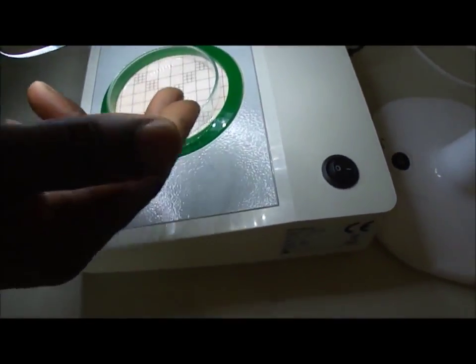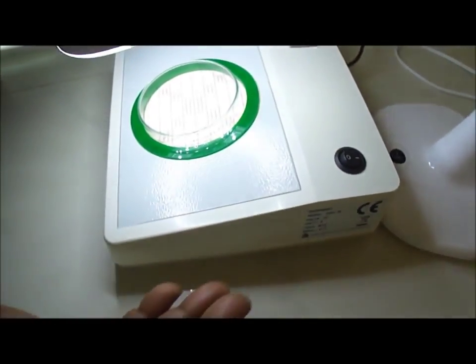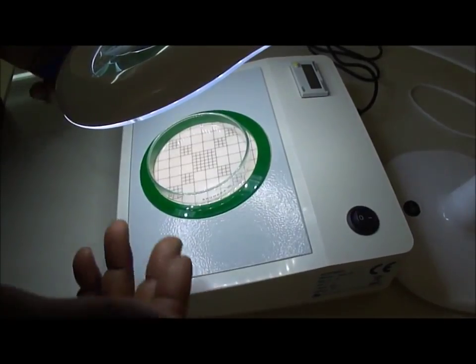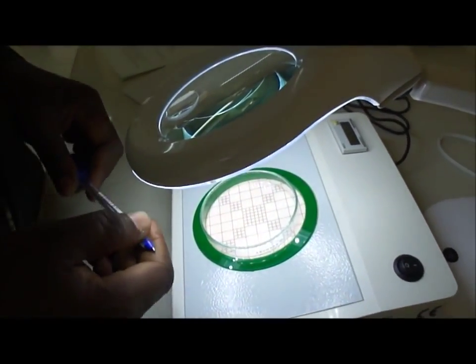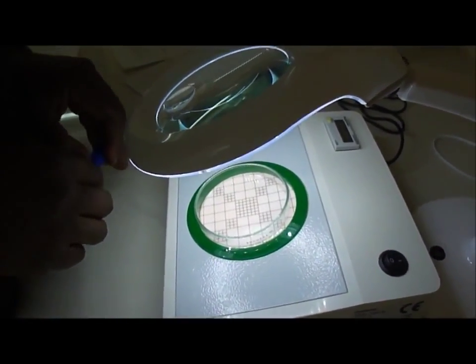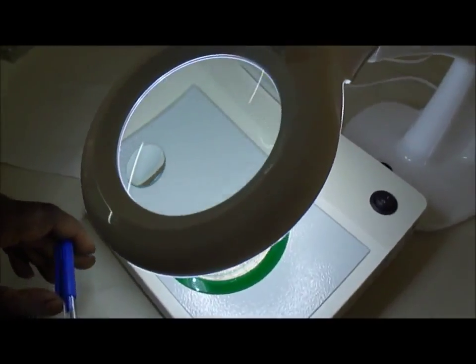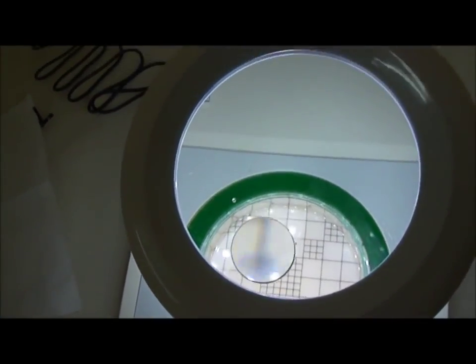And then if you have the number of colonies here, you know that if the dilution factor was, for example, 100, and you find that you have 10 colonies, then you multiply the 100 by 10 colonies, and then you have 1,000 bacteria in your original sample. That's all.